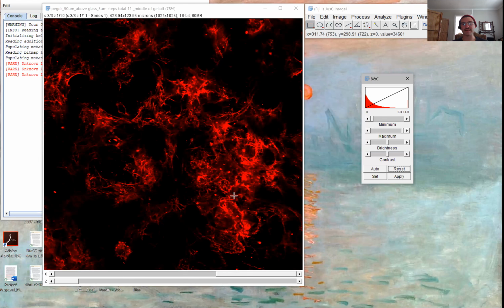The nice thing about the images is that you can always go back and get the original copy off of the confocal, but you don't know if somebody accidentally erased it, and it's just way easier to absolutely make sure you never save over your original file.